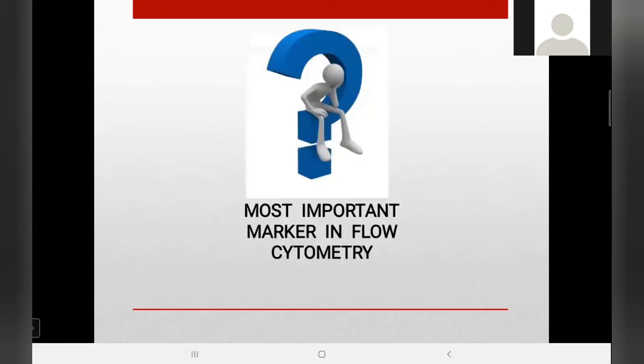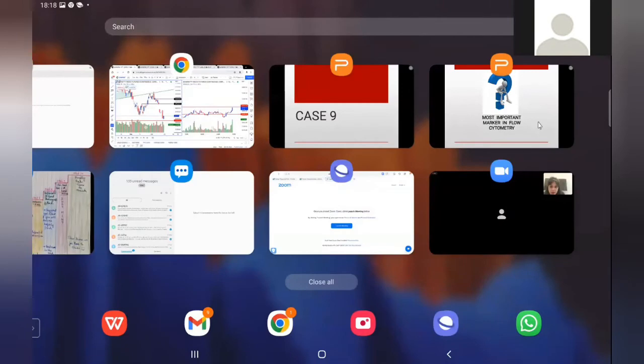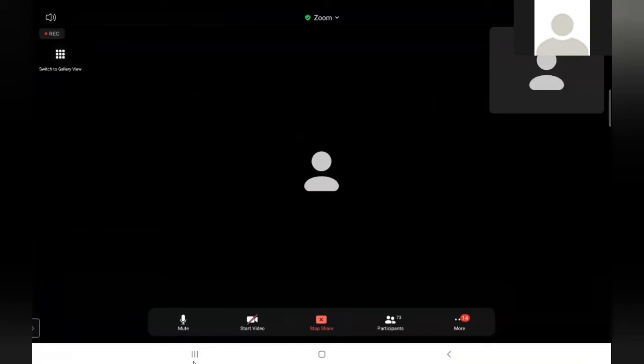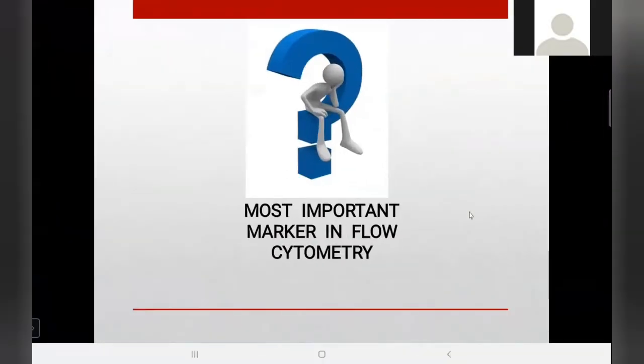All right. Now let's go on to the most important. When we're talking about the chemical properties, do you know which is the most important marker in flow cytometry? Can anybody answer that? CD34? No, not CD34. Anybody else? Okay, the most important marker in flow cytometry is CD45. CD45 gives you a very, very clear picture of what is happening in the peripheral blood.